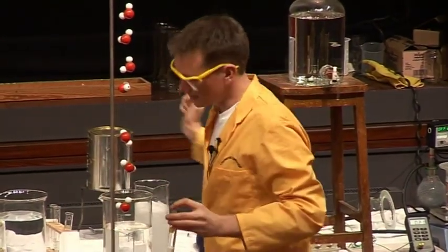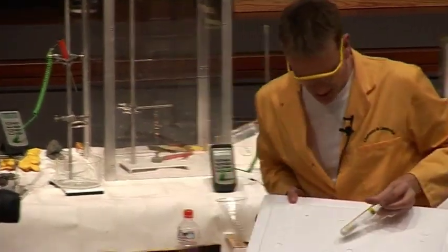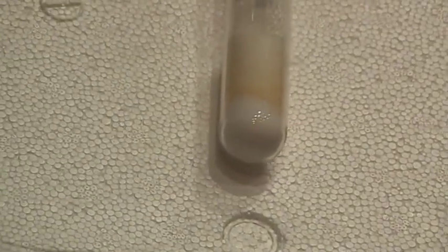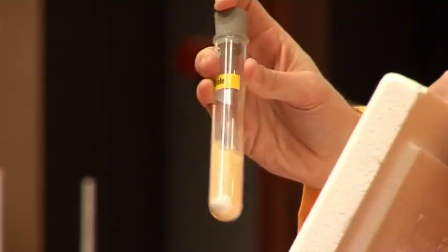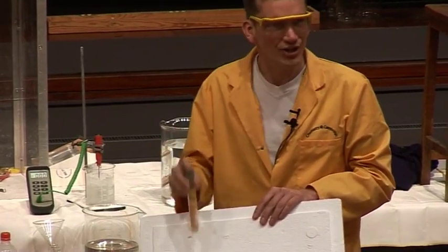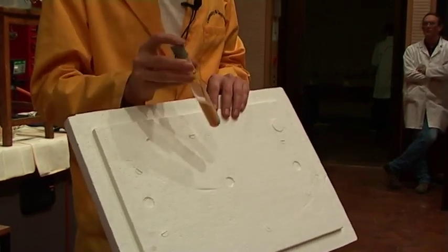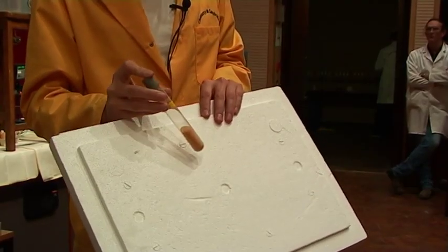Okay. And maybe I'll get a white background for this. And you may be able to see where they're mixing, there's actually a yellow line in between the two of them. Okay. Now, if I shake this up, we get a distinct colour change. We see a yellow colour here now, and this is a reaction that's taken place between two solids. The lead nitrate and potassium iodide have formed, well, this yellow colour is due to lead iodide.